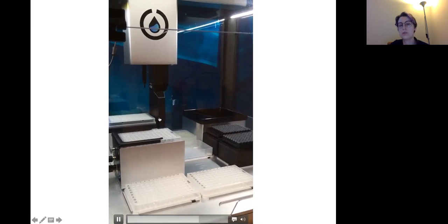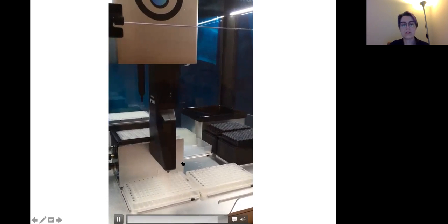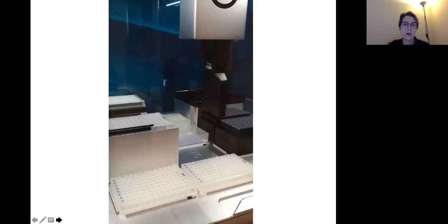Of course, you can have a multi-channel. You can do them by hand very quickly, but yeah. Is it going? Yes, and this is basically filling one big plate in a short time, in which you don't have to think, oh, have I done this row? Have I done this one? Have I already put here? You know, it's all a matter of also reproducibility of the experiments.